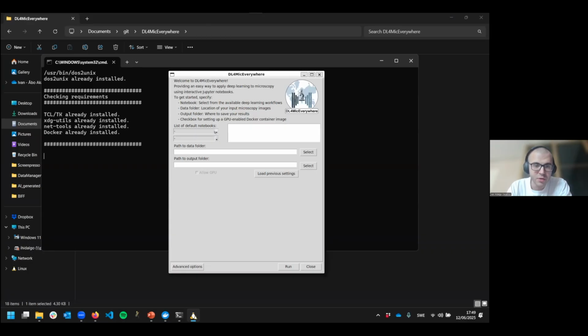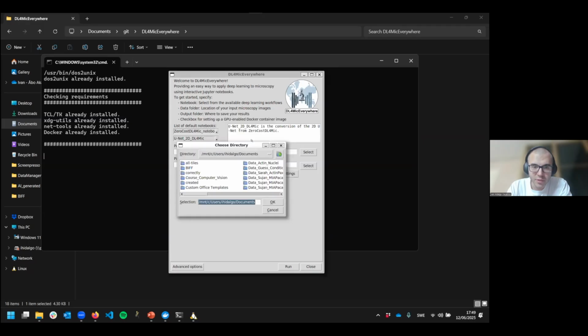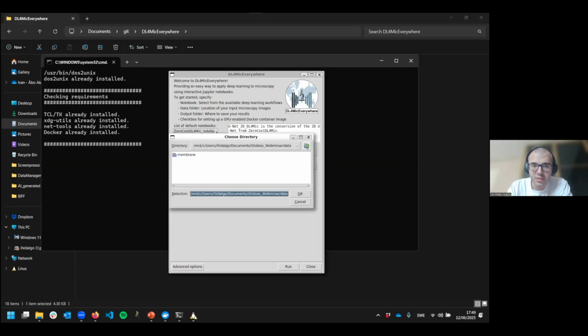Here, as I was saying, you need to choose from ZeroCost. I will be using the 2D U-Net in this case. Then you need to choose where you have your data. For example, I have it here, GloBIAS webinar data. And the results, I want to store them here. I already did some tests, so there are some cool models, cool U-Nets.